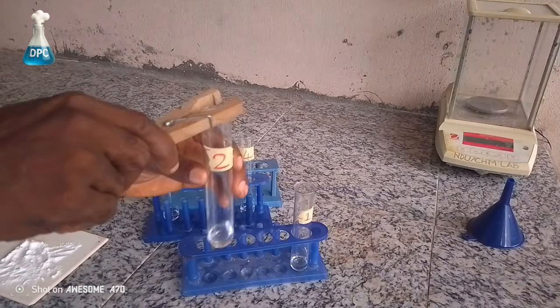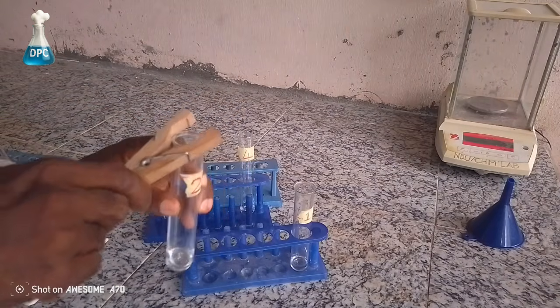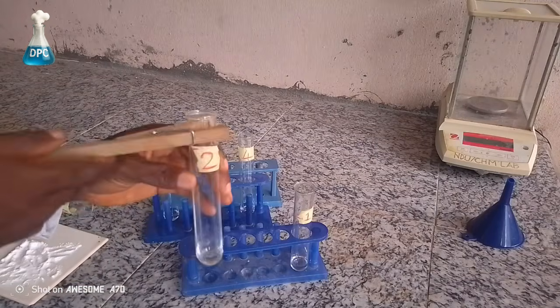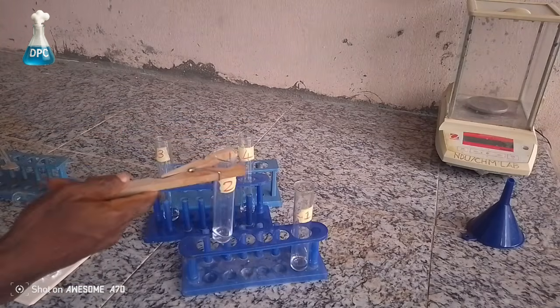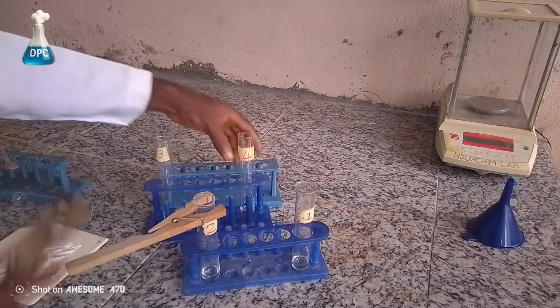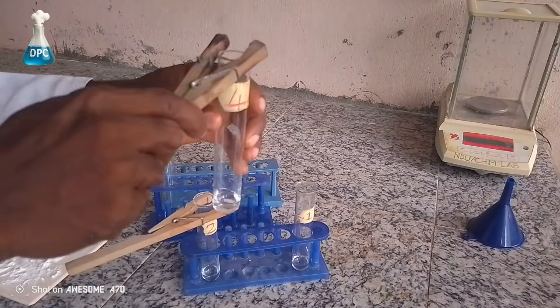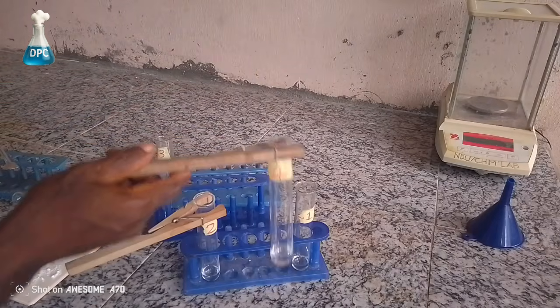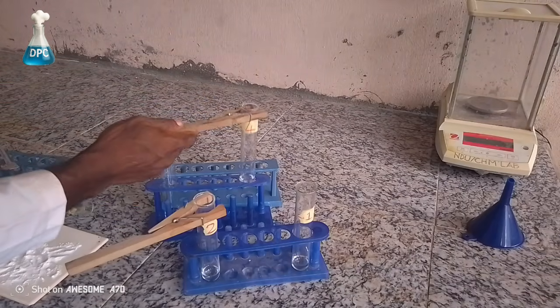Here we vary the temperature. We react a pair at room temperature while the other pair at higher temperature, which we will now take test tube 4 and test tube 2 to a hot water bath.